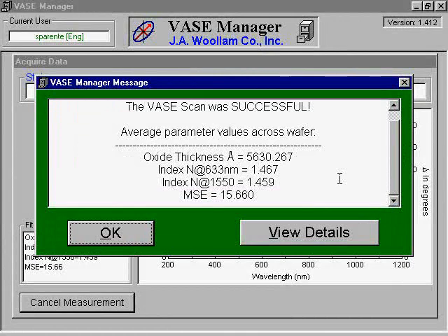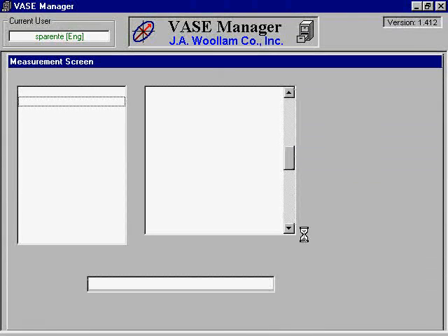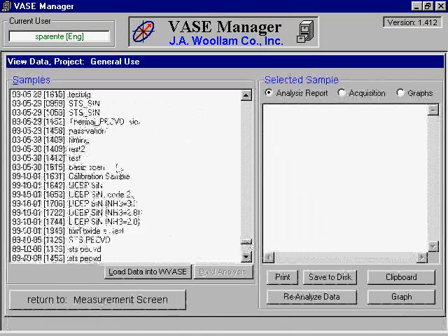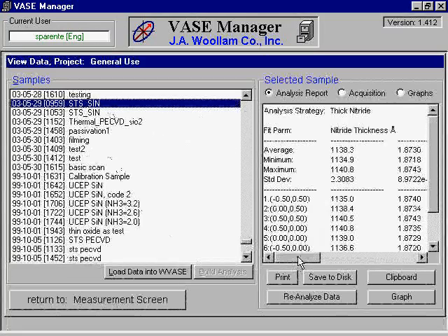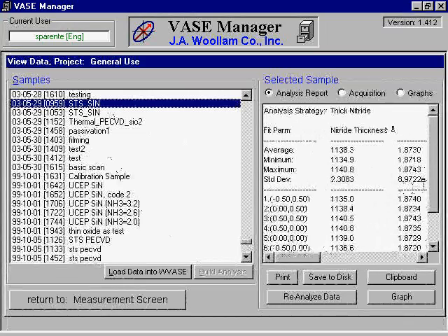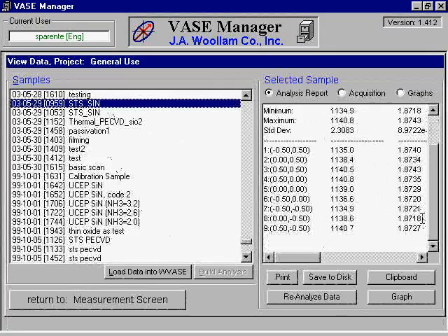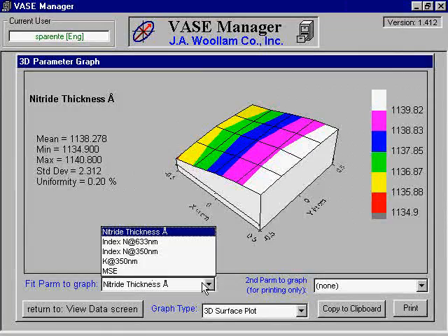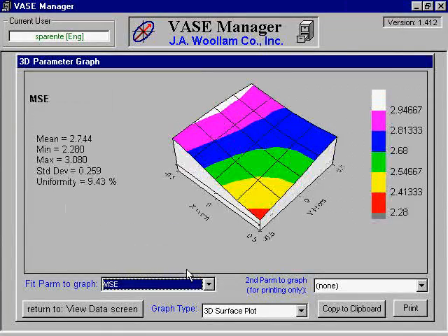Select OK if the results provided you with the information required and you are done analyzing the sample. Alternatively, you can click View Results if you wish to view more detailed information about your sample or would like to reanalyze it. In the Samples box, select the sample you wish to view. The samples are organized by date and labeled by the description you previously entered. Once selected, the results are shown in the text box on the right side. Data for all analyzed points, as well as the statistical data of the points, are shown. Clicking the graph button at the bottom will provide 3D graphs of different sample parameters and allow you to see how they change over the area of your sample. This graph can be most useful for viewing the uniformity of your sample.